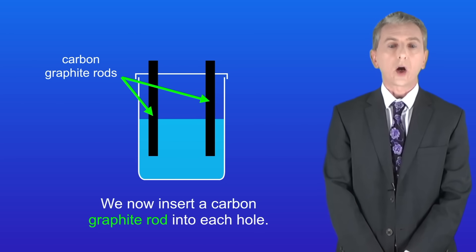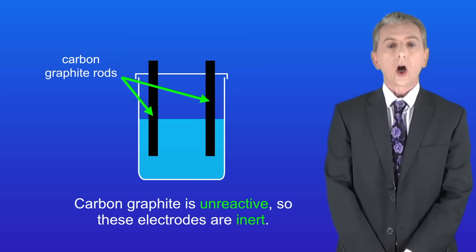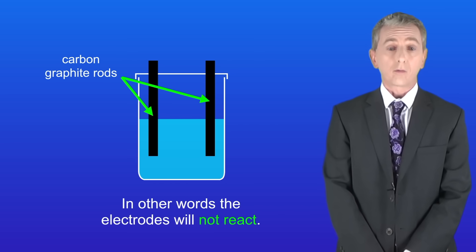We now insert a carbon graphite rod into each hole and these are electrodes. Carbon graphite is unreactive so these electrodes are inert. In other words the electrodes will not react.